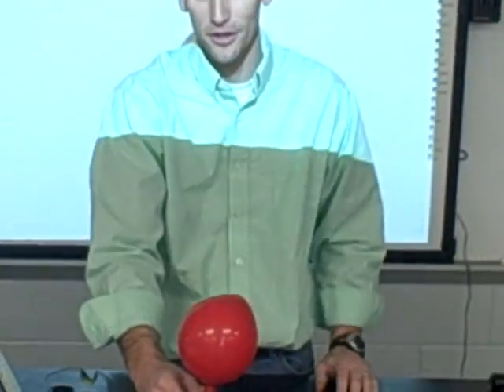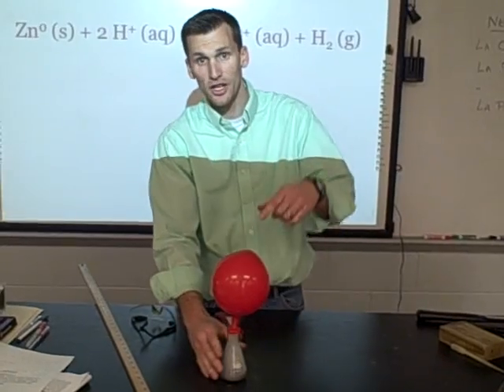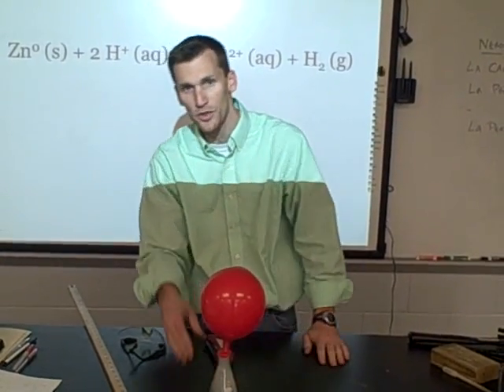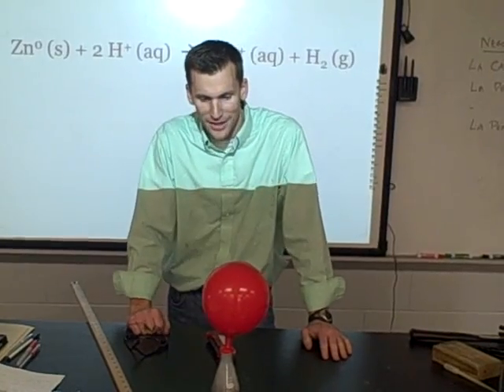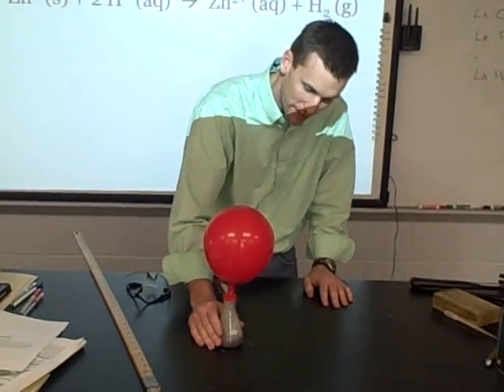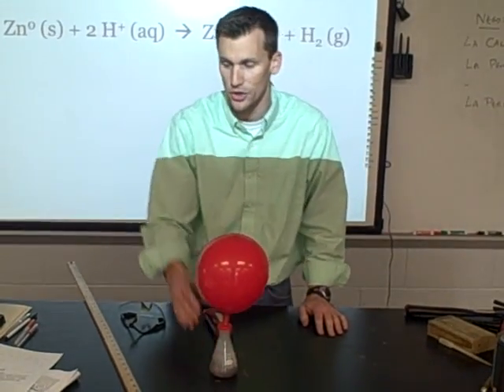What we have here is zinc solid was in our balloon. Our six molar hydrochloric acid was in our flask and we're producing hydrogen gas. It's a highly exothermic reaction. This flask is really hot.